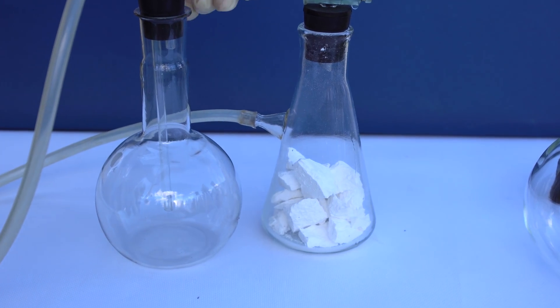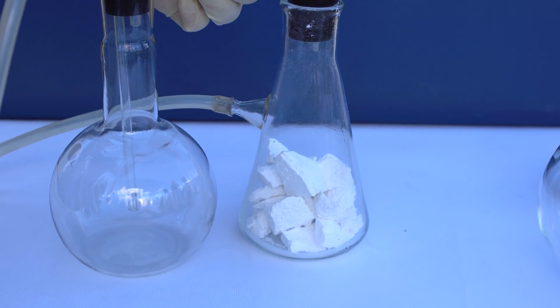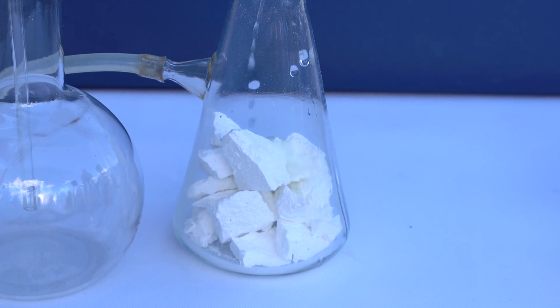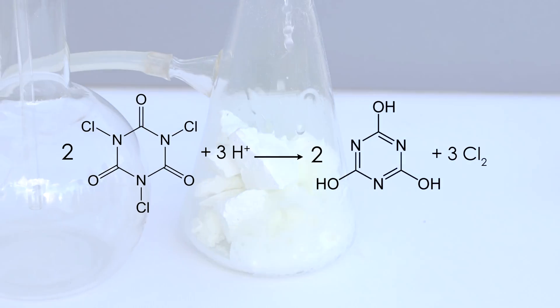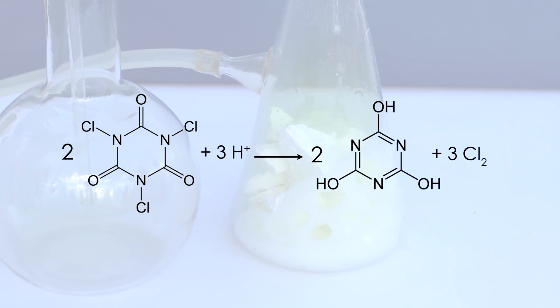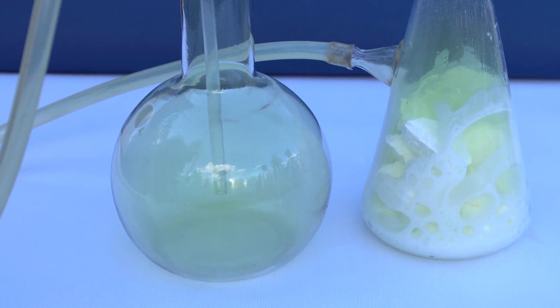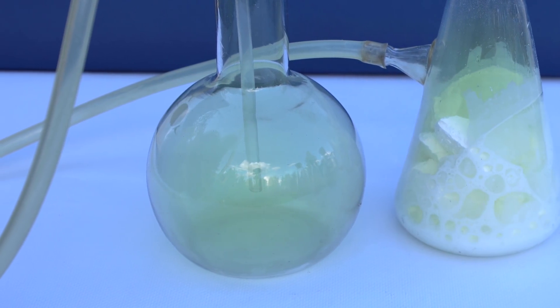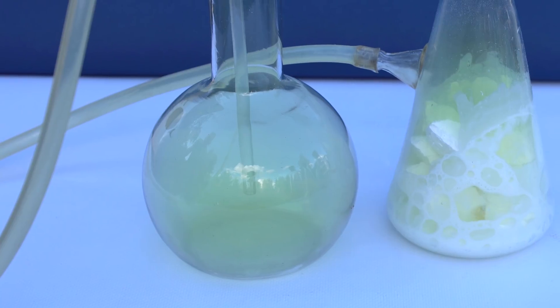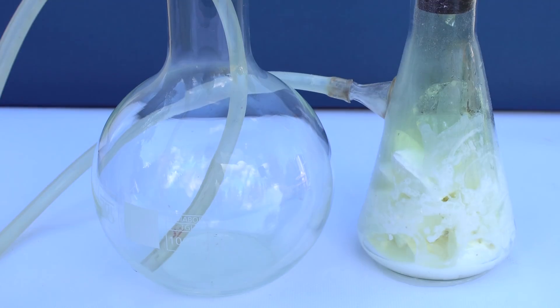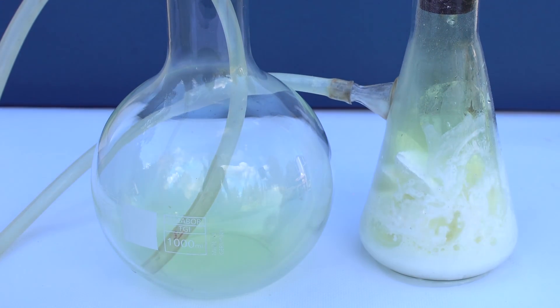To produce chlorine, I chopped the tablet of trichlorocyanuric acid, after which I started slowly adding hydrochloric acid to it. In an acidic environment, this acid decomposes with the release of a large amount of chlorine, which has a yellow-green color. I am storing the released gas in a flask, as chlorine is almost three times heavier than air, from where it can be easily collected from the bottom of the flask.